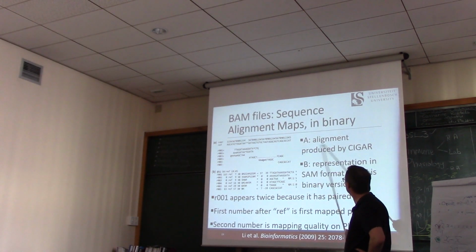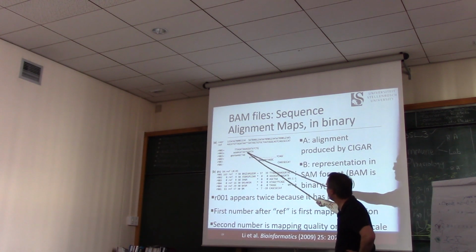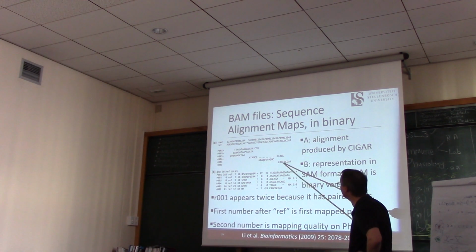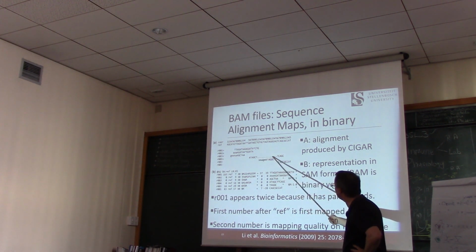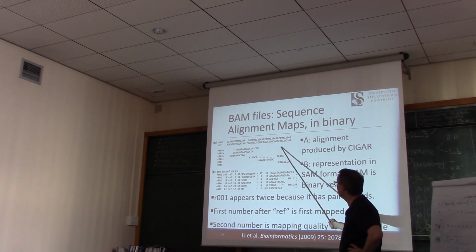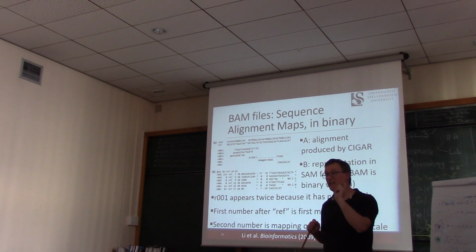We now have an alignment, here using some software called Cigar, that has mapped a sequencing read here, a sequencing read here, one here, another here, one through here, and down here. Some of these have greater strengths, some of them have weaker strengths. In fact, in this case, we have a big gap that we need to introduce in this read to make it match properly to here and to here. We even have this really odd property that this one and this one are known to be opposite ends of the same template. This is something called paired end sequencing.